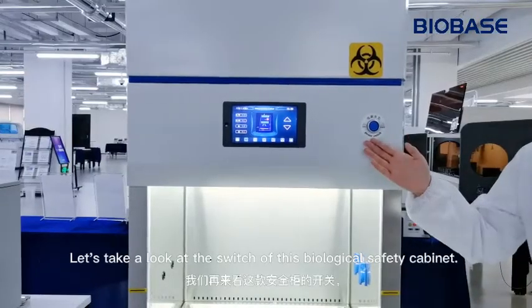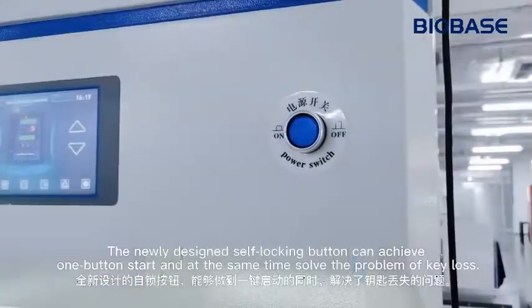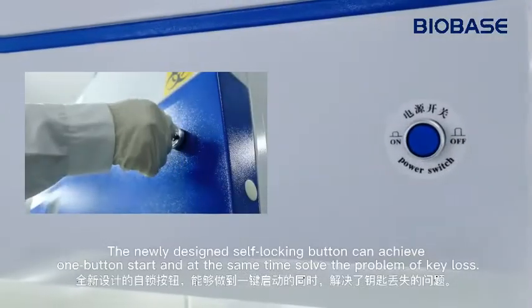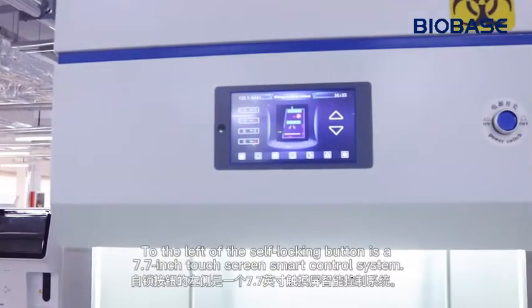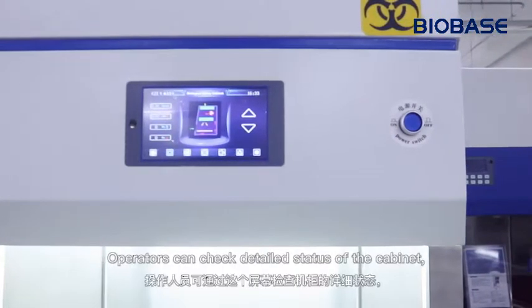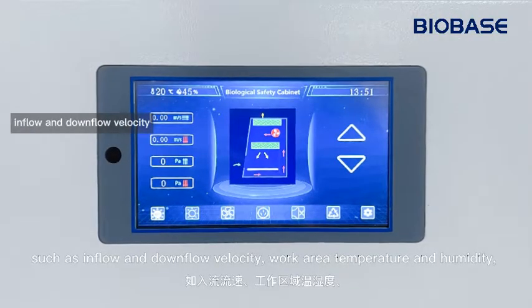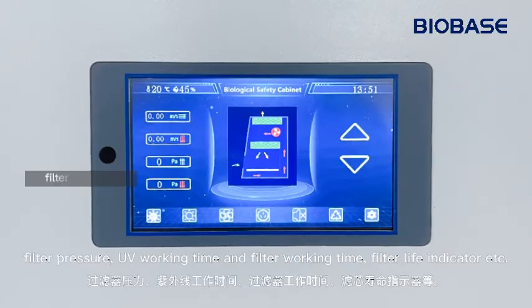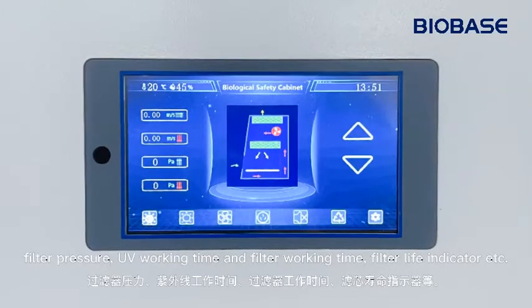Let's take a look at the switch of this biological safety cabinet. The newly designed self-locking button can achieve one-button start and at the same time solve the problem of key loss. To the left of the self-locking button is a 7.7-inch touchscreen smart control system. Operators can check detailed status of the cabinet, such as inflow and downflow velocity, working area temperature and humidity, filter pressure, UV working time, filter working time, and filter life indicator.